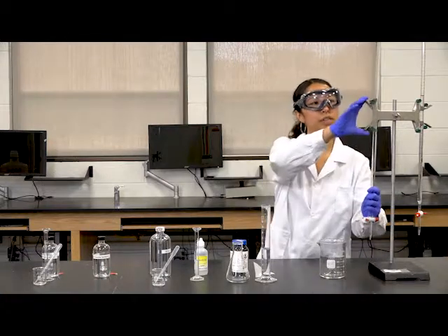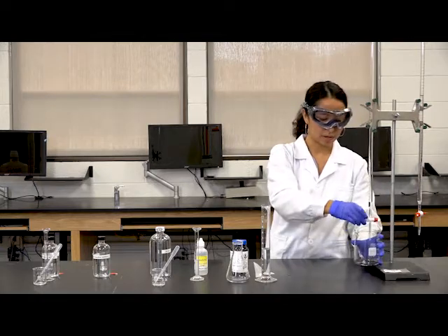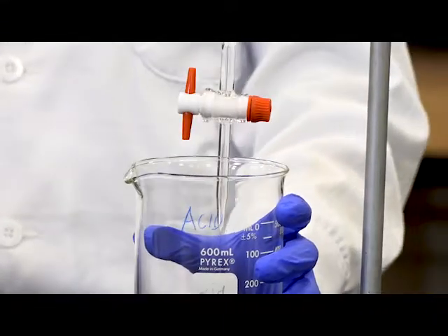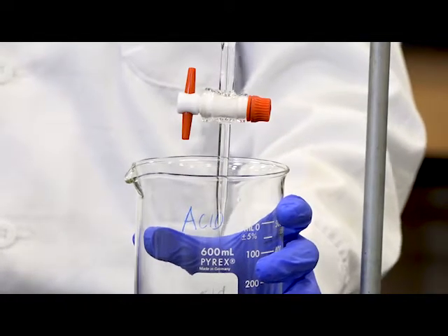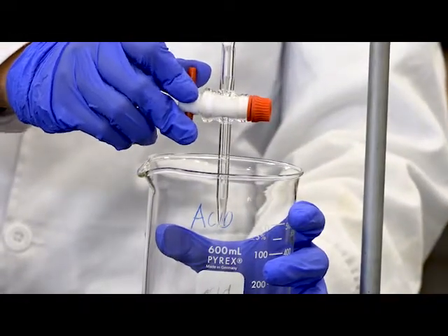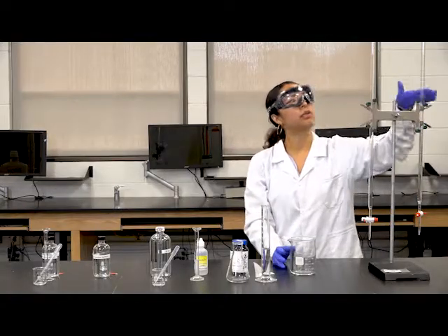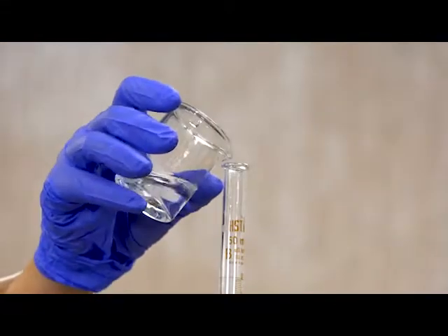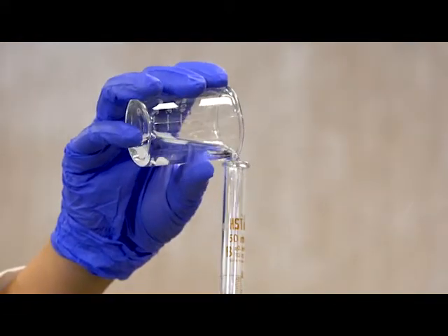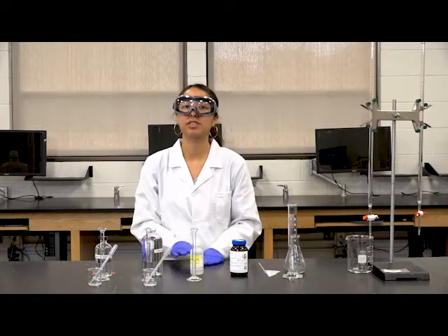To decant the solution, please put it in the safety holder. Put the waste beaker underneath and open the burette to let the liquid flow. After all the liquid is out of your burette, you're ready to fill it up. I already have a burette on this side filled out, and I'm just going to refill it all the way to the 0 mark.